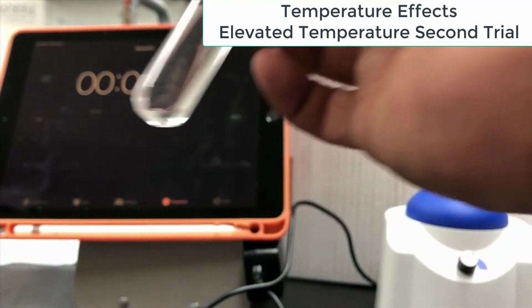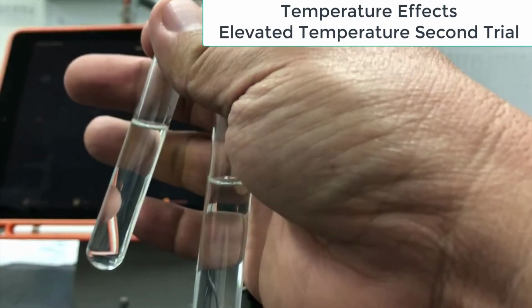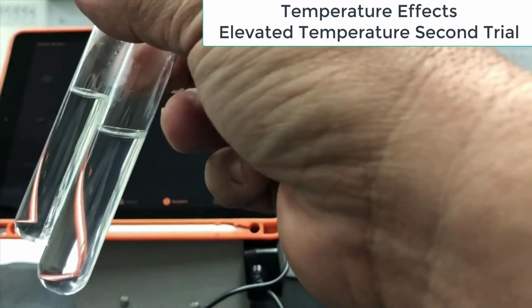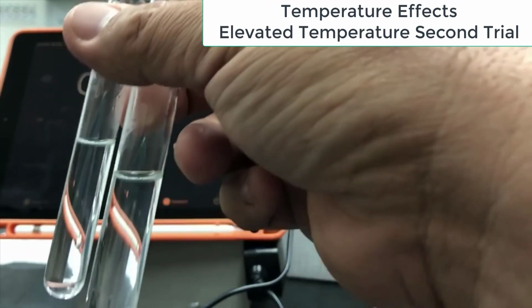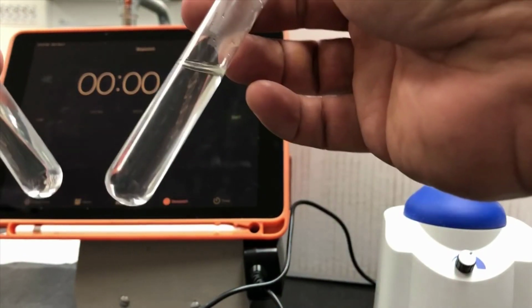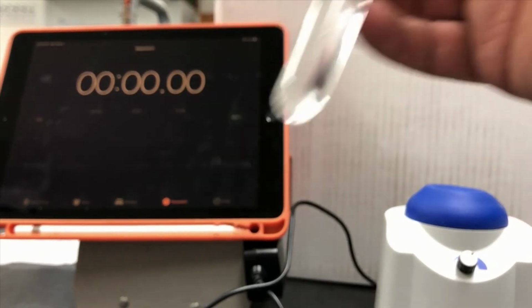This was, again, about the same temperature. Really, the way I'm doing this is I got a hot water bath, and I'm allowing it to cool down, and then I control the time that the test tubes are in to keep their temperature below about 35 degrees. This is the thermometer. I just stick it in there and I monitor the temperature. The reason I do that is because thiosulfate breaks down at higher temperatures, and so the longer it sits in there, the more of a false value that it'll give you for your final result.